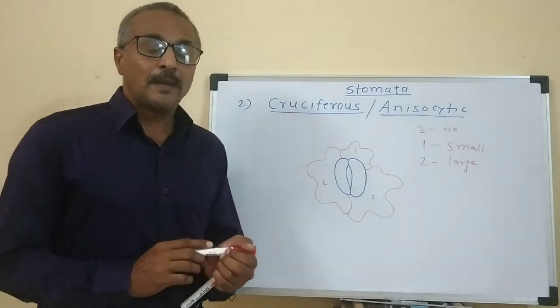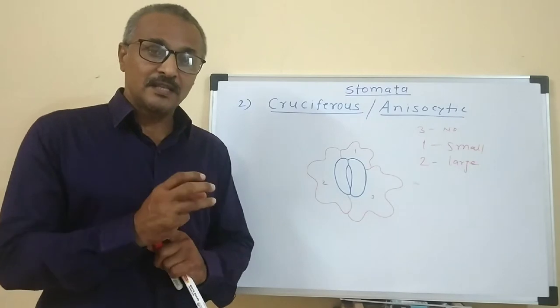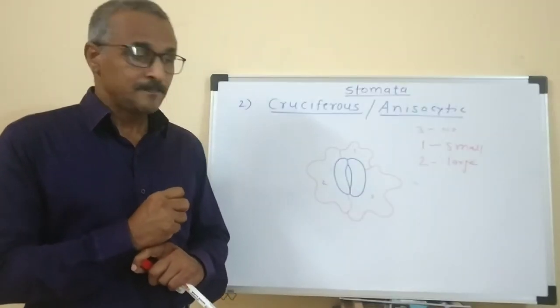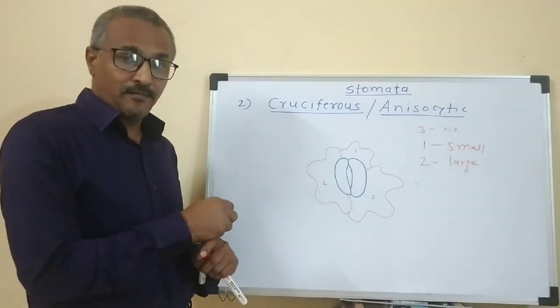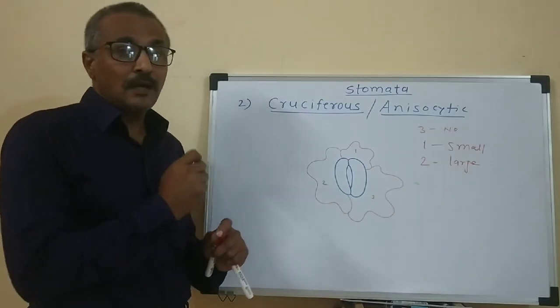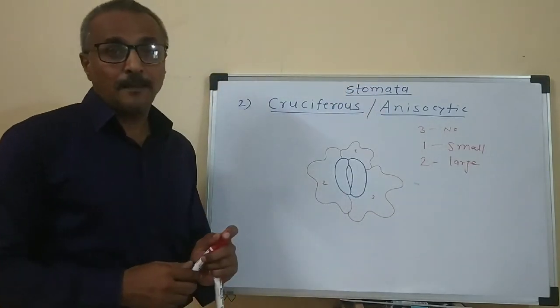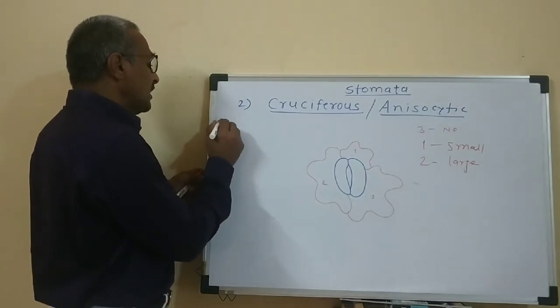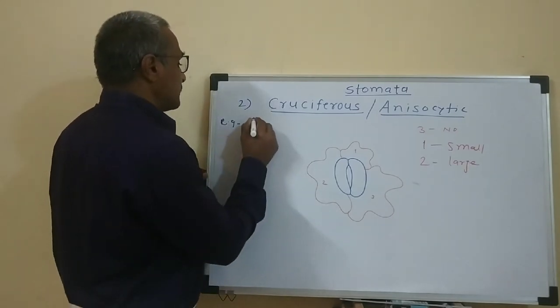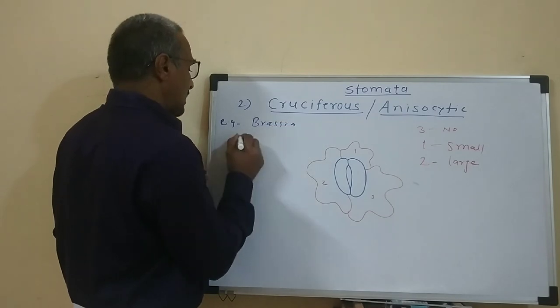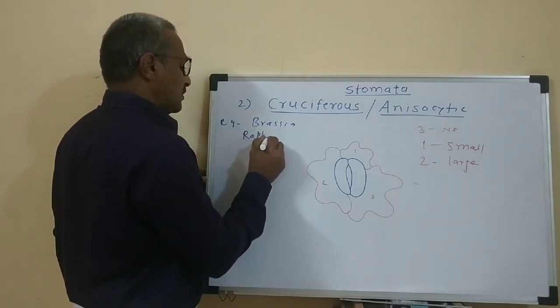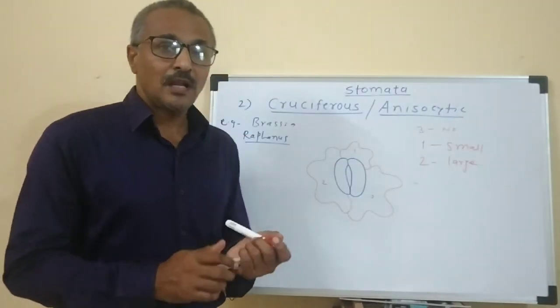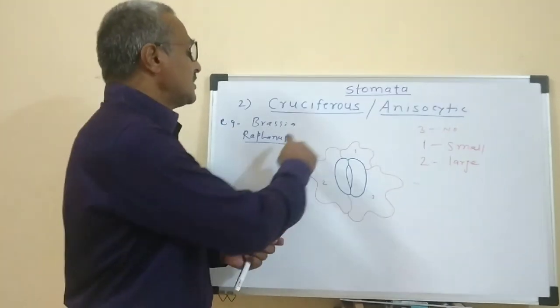This is the anisocytic arrangement of the subsidiary cells in the stomata. It is called the cruciferous or anisocytic stomata. These stomata are found in plants of Cruciferae — that is, in Brassica and related plants. This is called the cruciferous type of stomata, found in all plants that belong to Cruciferae.